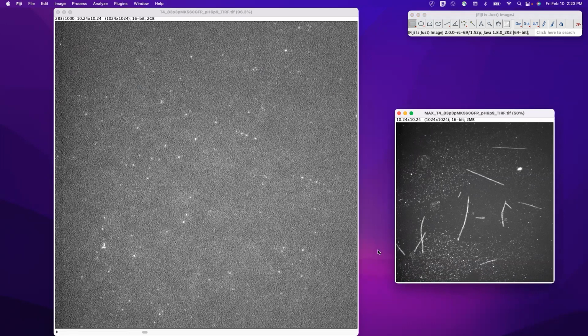I'm gonna open up Fiesta. I just did this so I can see where the microtubules are. My poor computer. There it is.